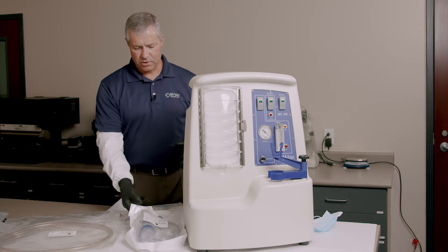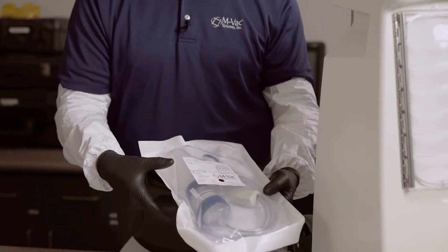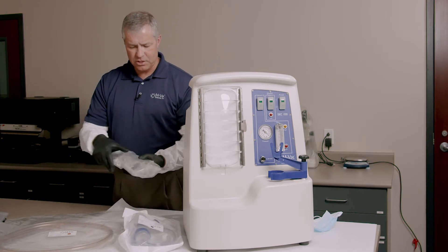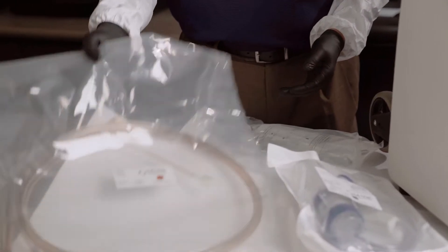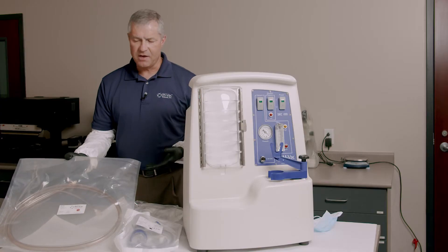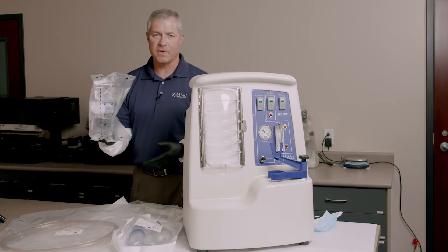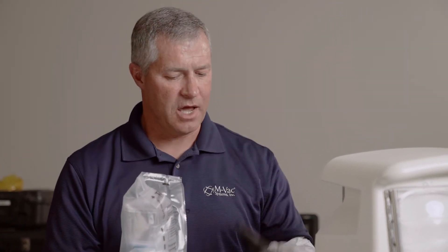I just want to introduce these really quick. Number one, this is the actual MVAC — that's the actual collection device. Then we have the solution. It's mostly water with a little phosphate buffer in it, very similar to what you would put on a swab to take a DNA sample. This is what we call the extension tubing — it can go from five feet all the way to 60 feet, but typically a five-footer or ten-footer is what most agencies use. And then the last thing is a filter — this is a 0.45 micron filter, and this is how we concentrate the sample after it's been taken.